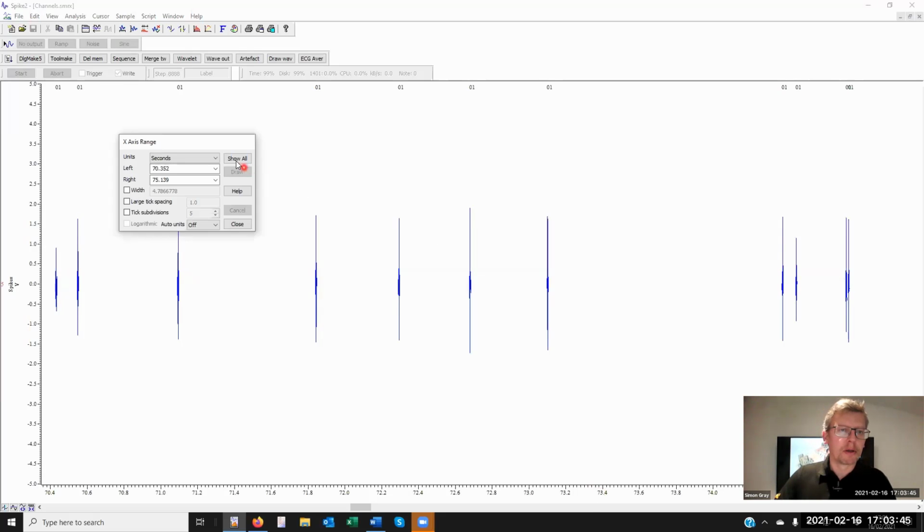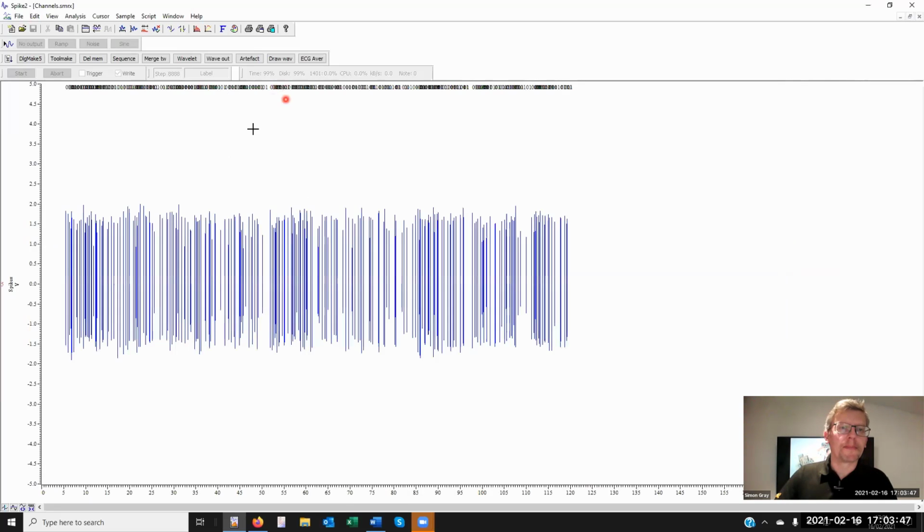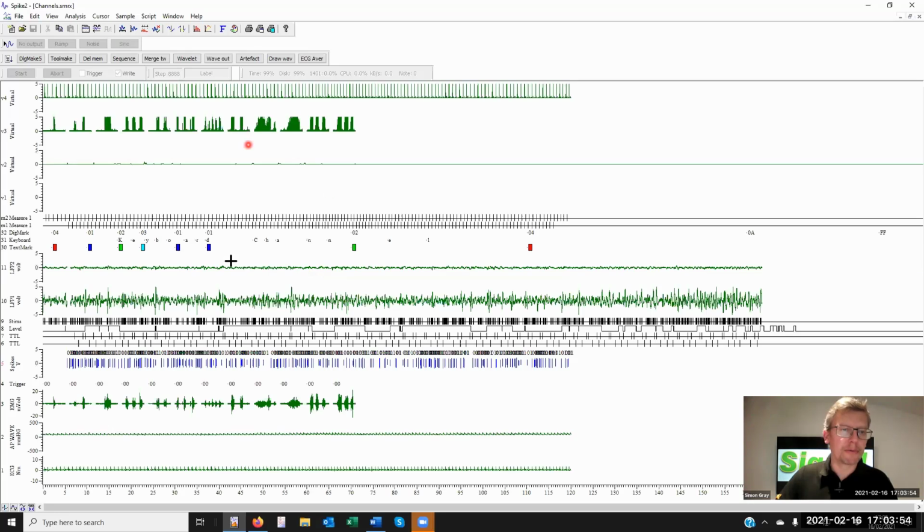Right. So marker filter, a means of showing and hiding different codes. If we go back a level, we look at the text marks, you'll see the codes here, 0, 1, 0, 3, 0, 2. Again, the marker filter will show and hide those markers according to your request.